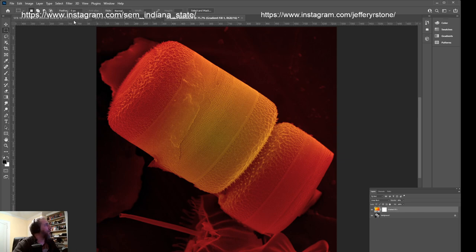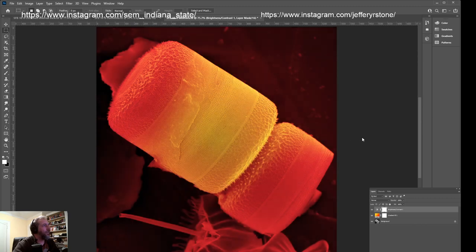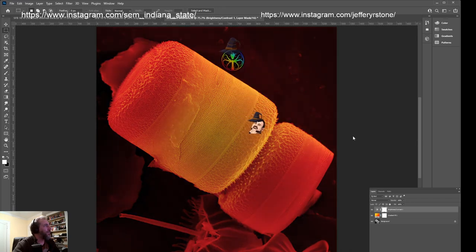So we can make an adjustment through a layer if we wanted to. Turn up the brightness a bit and the contrast. So I'm just using a layer to make it brighter. That's not bad. A little monotonous, just two colors, right? So we could make some adjustments to that eventually.